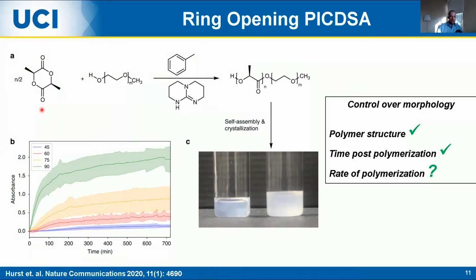So that occurs when you create a situation in which the polymerization conditions are favorable as well as the self-assembly conditions. And in this specific case, we're actually doing self-assembly by crystallization. And so everything occurs in a single pot. What's kind of unique to the system that Paul developed here is that the self-assembly and crystallization is very slow compared to the rate of polymerization.